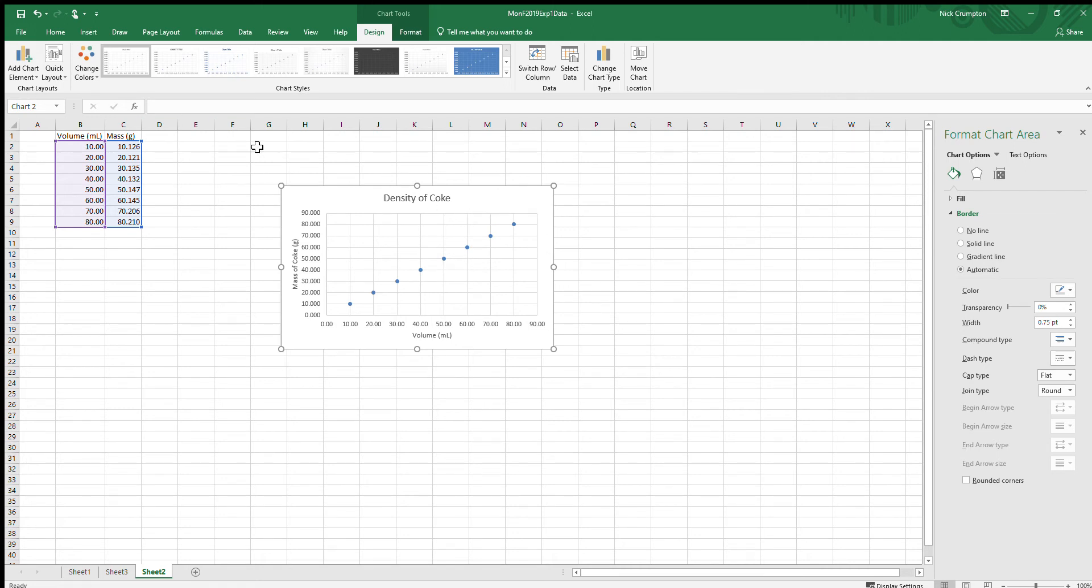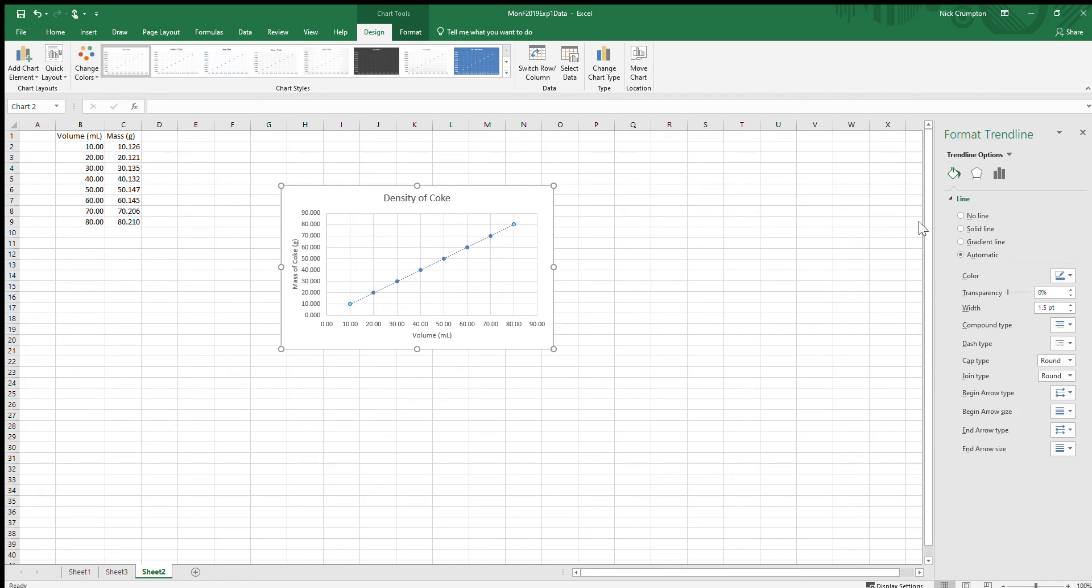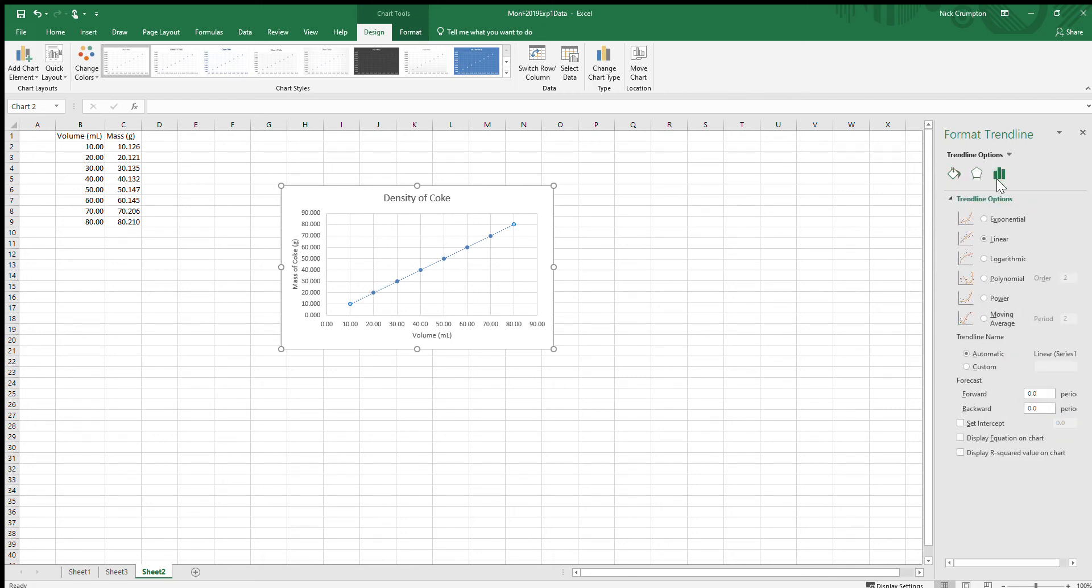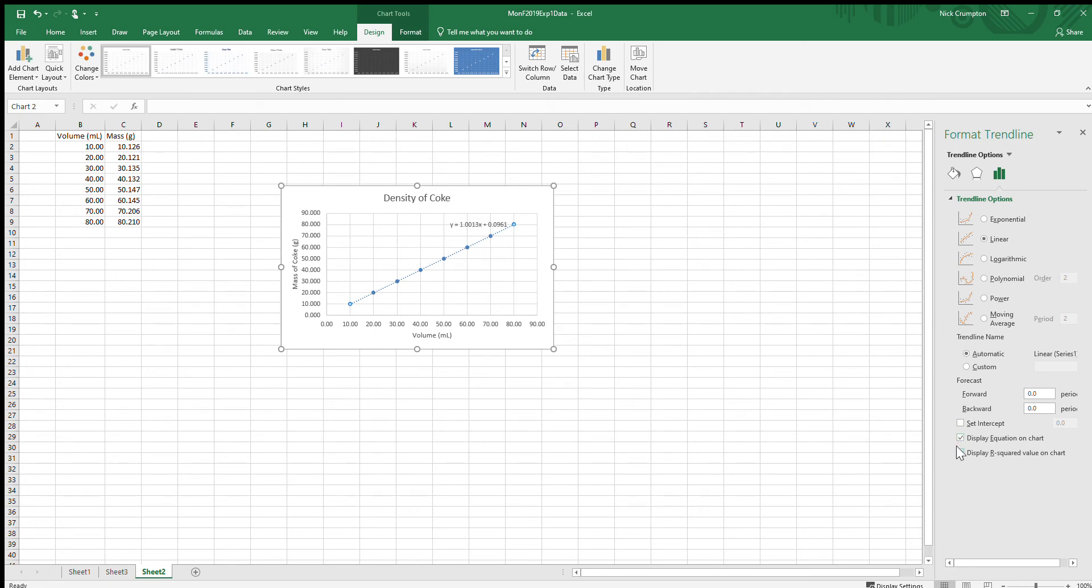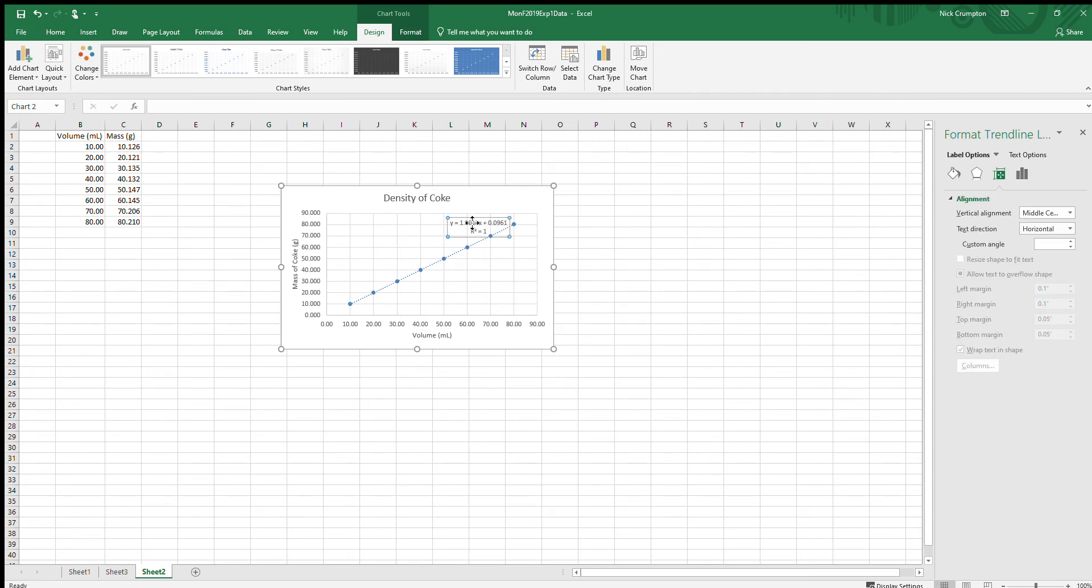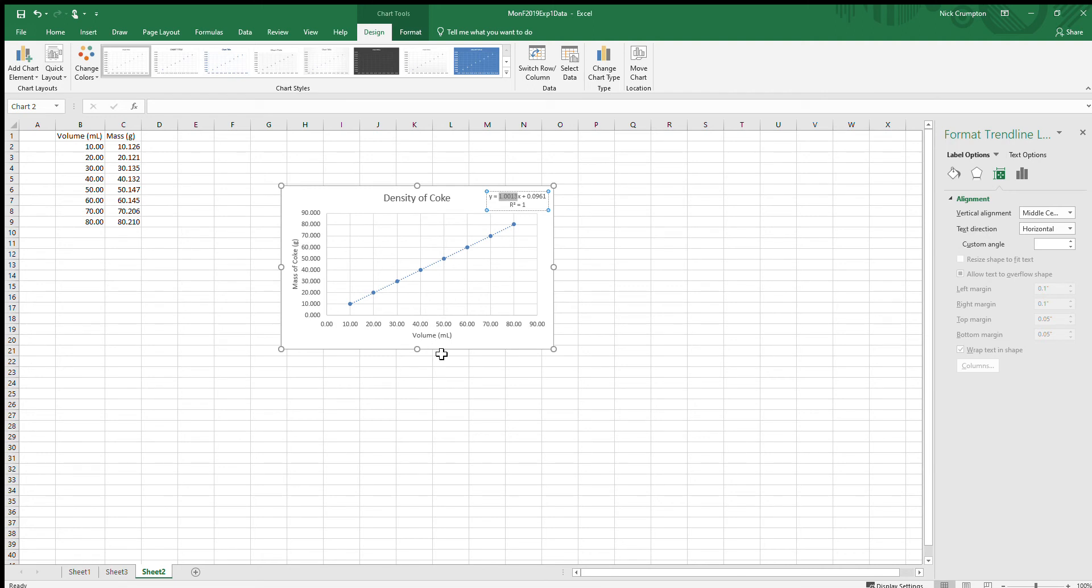The last thing we need to do is add a trendline. I go back to Add Chart Element, Trendline, and click More Trendline Options. This is a very linear plot, so I'm going to take Excel's suggestion of linear. What I want to do is display the equation of this line and this r squared value on the plot. This is your y equals mx plus b equation. So the slope of the line is 1.0013 grams per milliliter for our density, and then the intercept, the y-intercept, where this line extrapolates back and hits a value of x equals zero, my y is 0.0961.